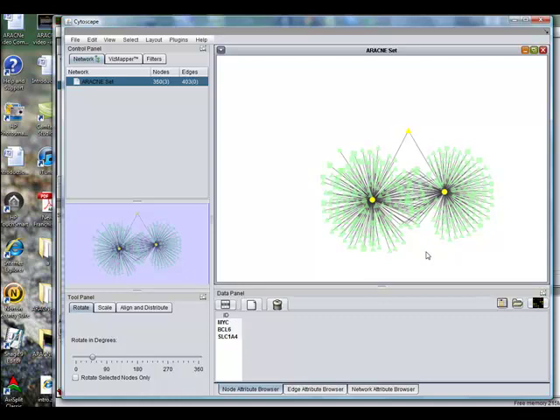This video is intended to be a beginner's guide on how to set up and run ARACNe in geWorkbench. If you're interested in learning more about ARACNe, please refer to the geWorkbench main webpage for more details.